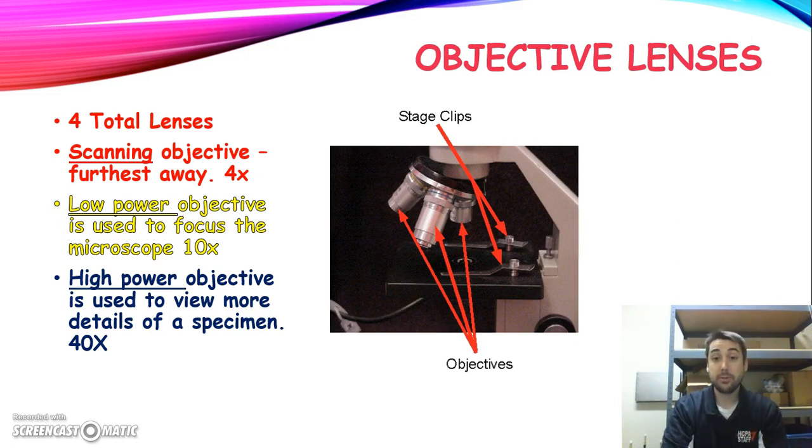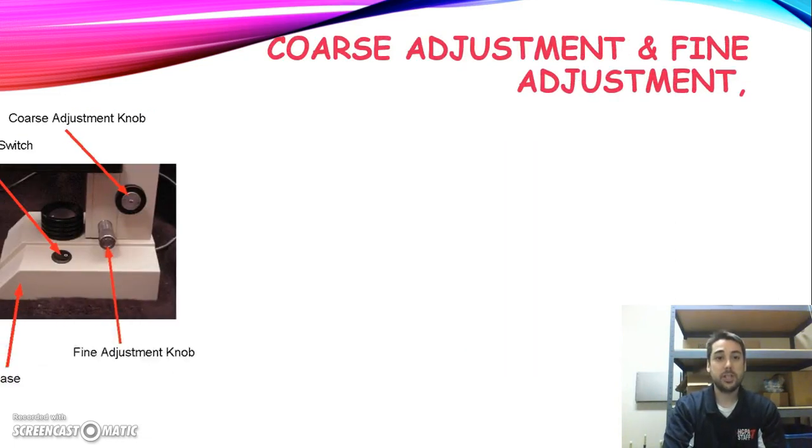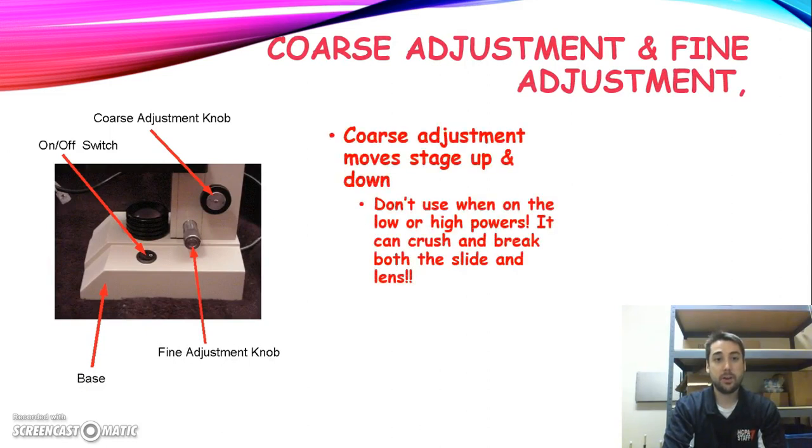There are some microscopes that do oil immersion that would be 100x, and they can even do even bigger. So those ones are very, very cool. But again, we're just going to focus on the general ones that you see. So total magnification, eyepiece times the objective. Very simple.